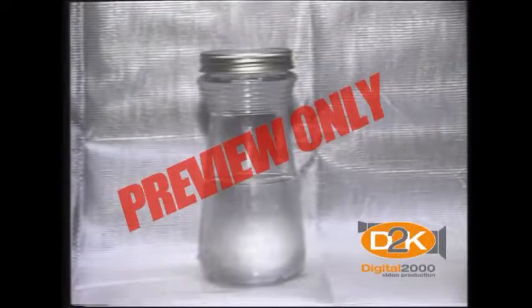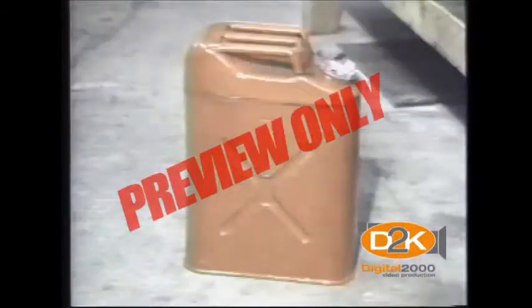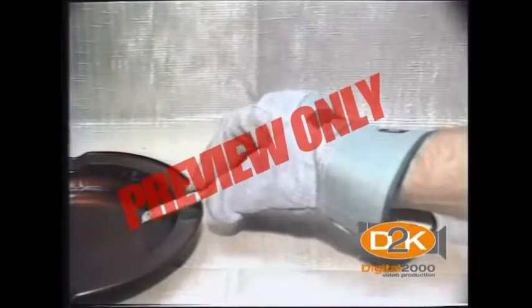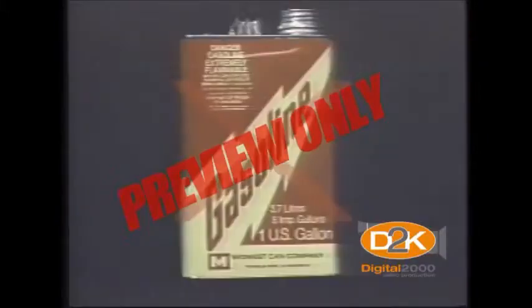Storing flammable liquids in glass containers or non-safety containers such as this gas can is asking for a fire. Break the glass and the liquid spills. Add in a source of ignition and you have a fire or explosion. Using non-approved gas cans is equally dangerous.